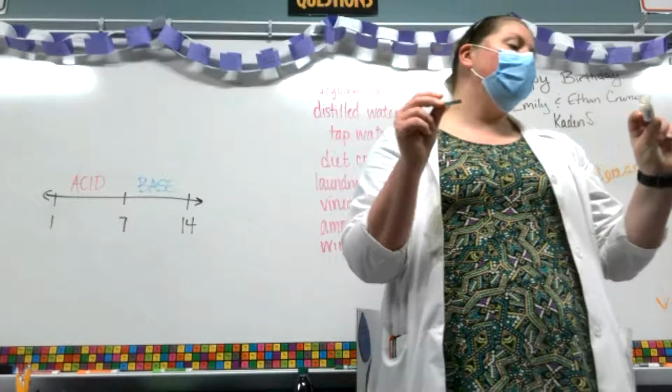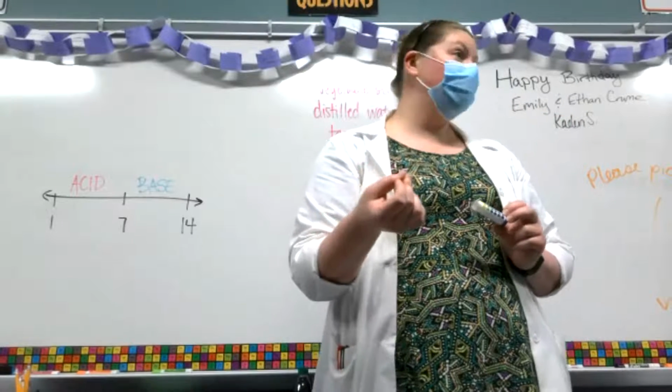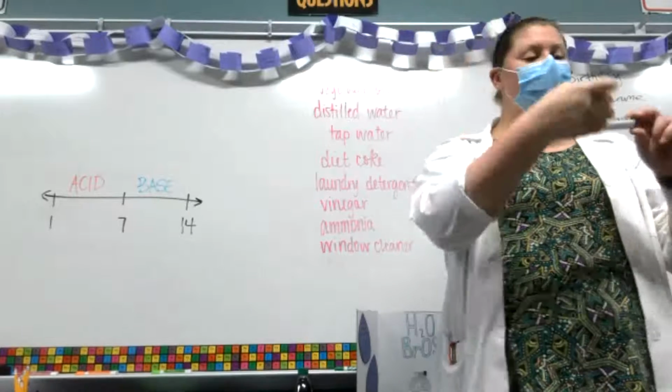Okay. Now, if you hold it up and it looks like it's between 2 of them, you can always say like 9.5 if it's between 9 and 10. That's okay. All right. But you're just going to test them and do it.